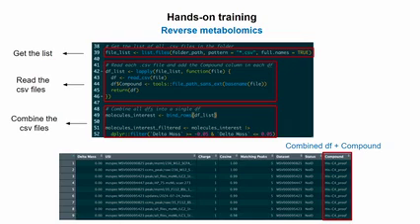Maybe it's because it's not a numerical value in your table. Oh, do you have the tables loaded? Yeah. Do you have the table loaded? Yeah, and the delta mass is not there, so I think it's one step before that. But it should be part of the tables when you load them, actually. So maybe you can check.